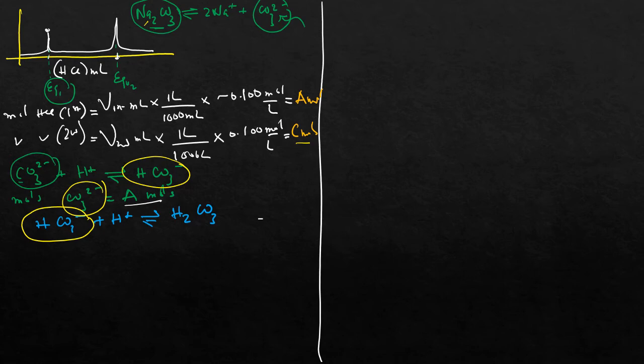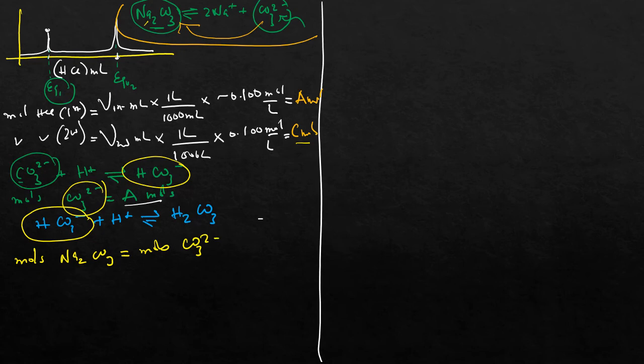Remember from this reaction up here, the mole ratio is what? 1:1, meaning that moles of your sodium carbonate will be equal to moles of what? Your carbonate ion.